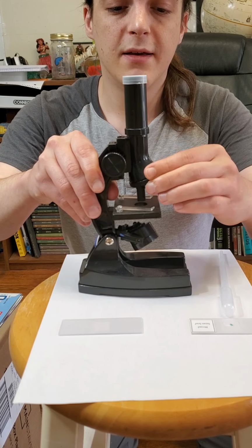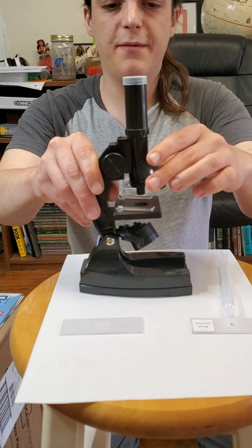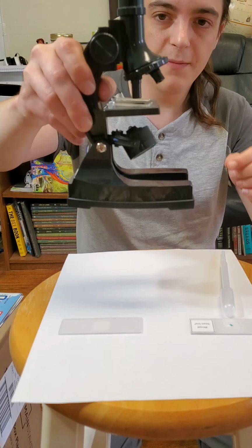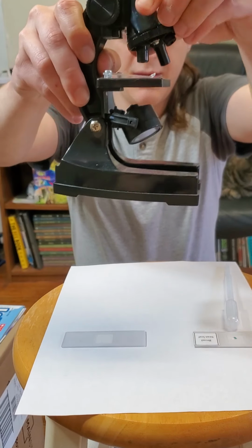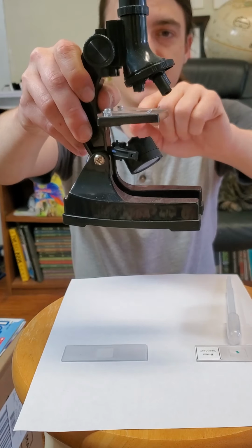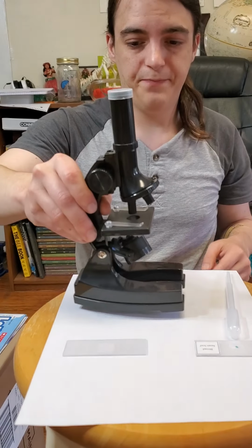I've got 450 times magnification, that one, and then 900 times magnification. You'll notice as I turn it that each lens is longer. Your smallest magnification is the smallest lens, and your biggest one is the longest one.